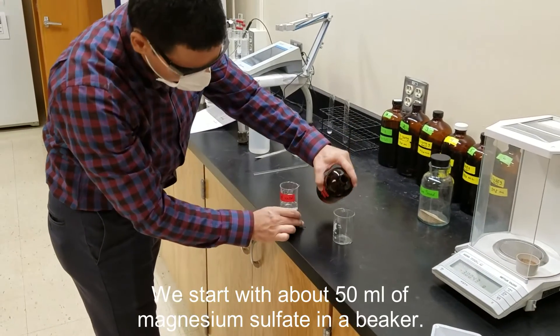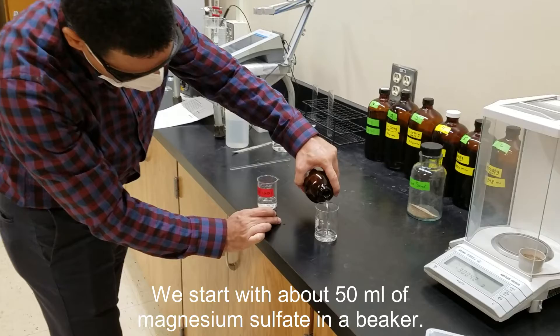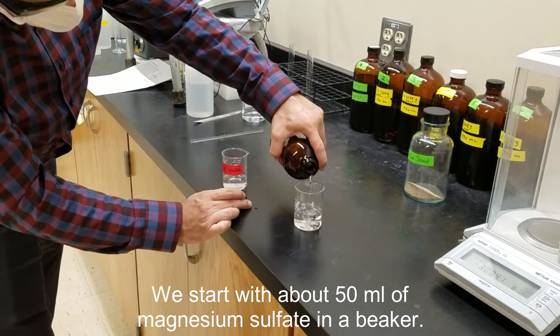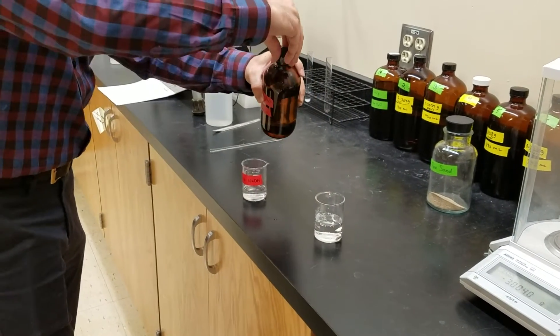To start out, we pour about 50 milliliters or so of magnesium sulfate into a beaker. This is magnesium sulfate.